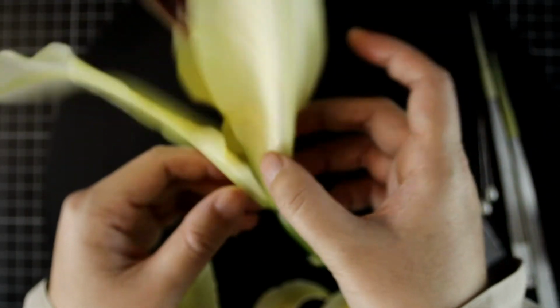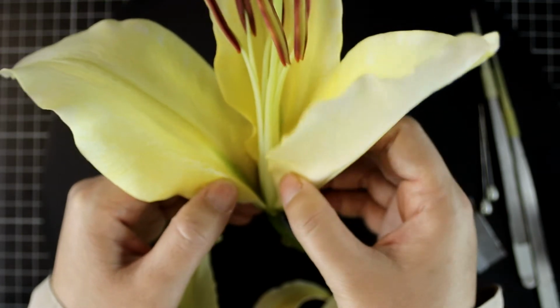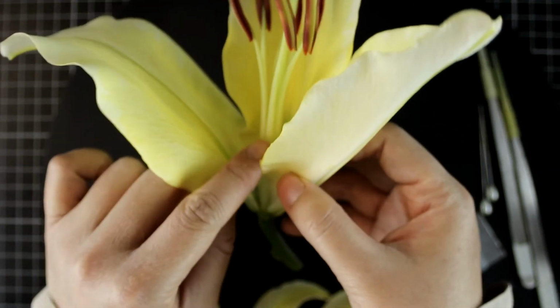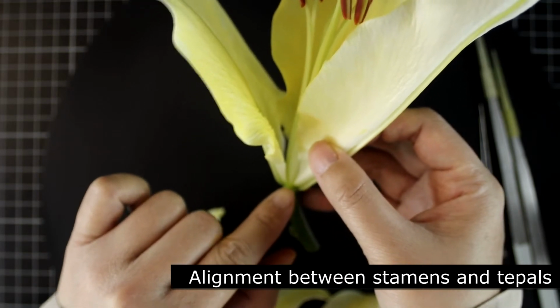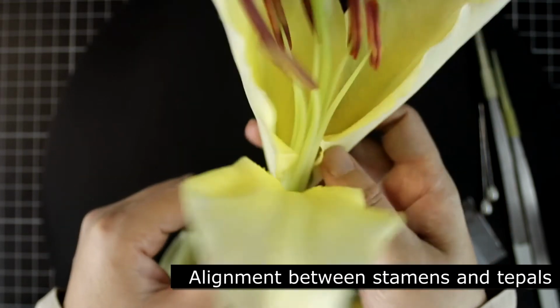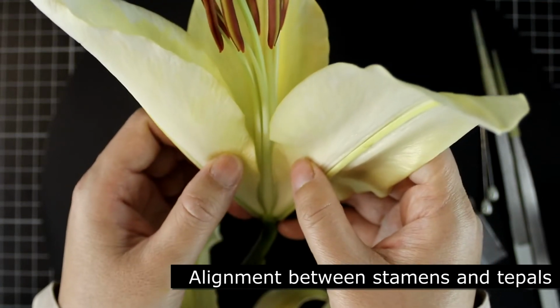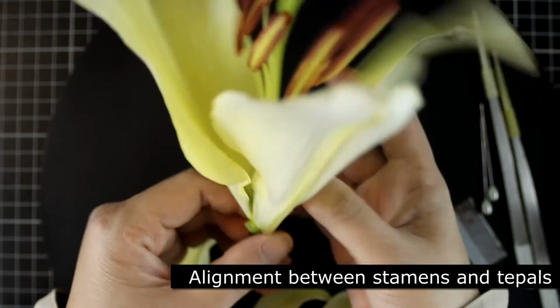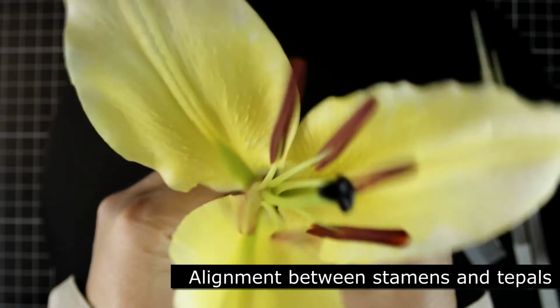Now you can find the stamen as I remove the outermost whorl. And you find that the stamen actually is aligned with the attachment point of the outermost whorl tepal. One here, another here, another here. Okay.